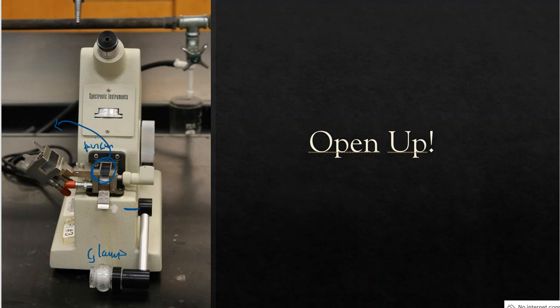When I do put a few drops of liquid on the surface of that prism and I close this back and raise the lamp back up, there's going to be some adjustment. This is not an automated instrument. The new refractometers are automated. I just literally put 1 or 2 drops on the surface and I hit run and it tells me the number. I don't have to worry about it. But these are more manual. These are more old school. So that means I'm going to have to make the adjustments. I'm going to have to fine-tune this instrument in order to figure out which hydrocarbon I have from the table.